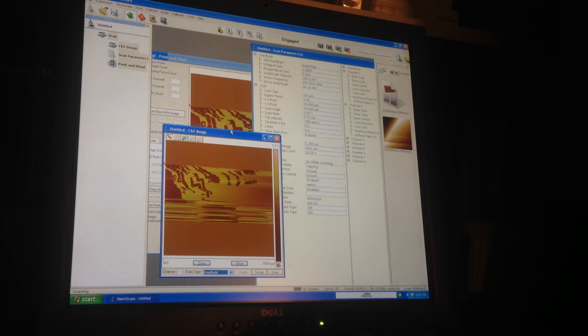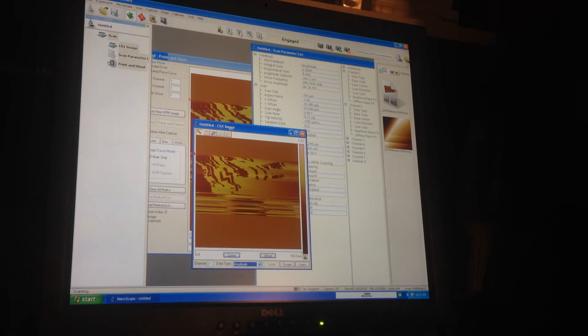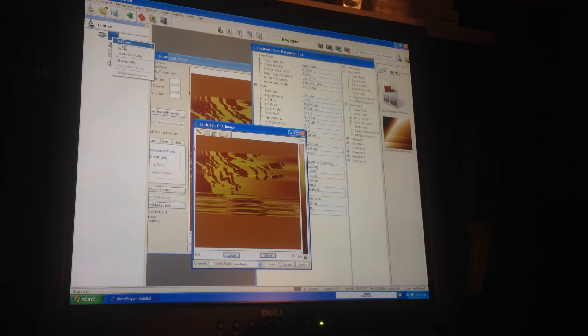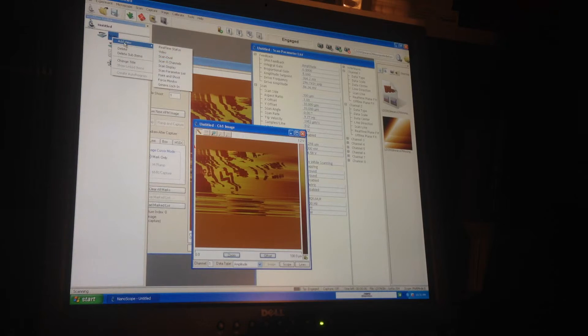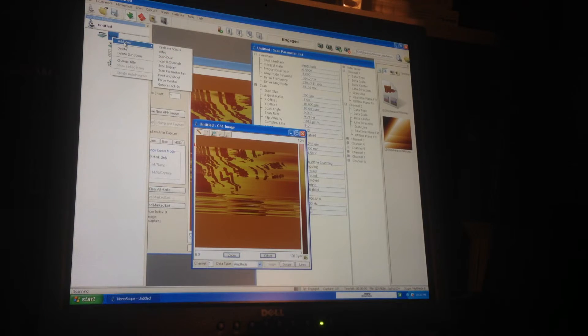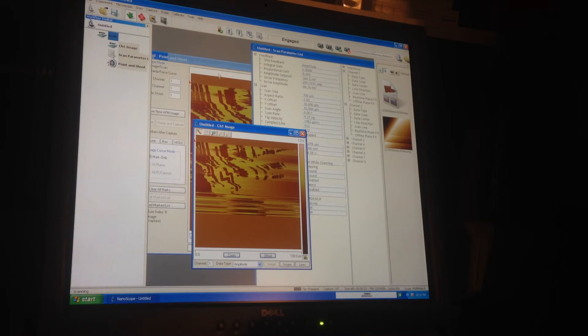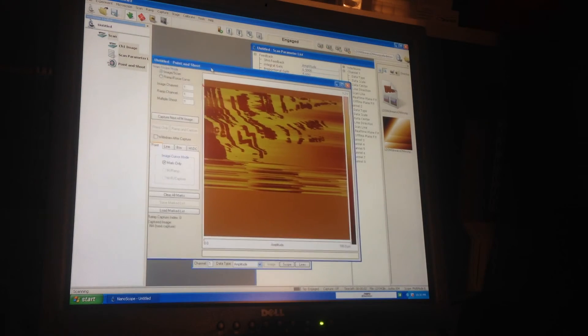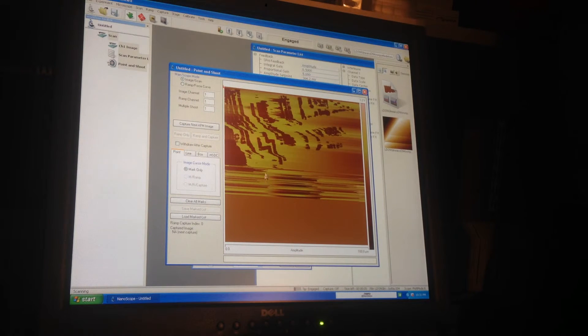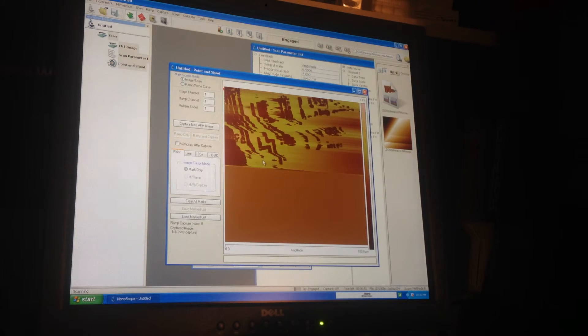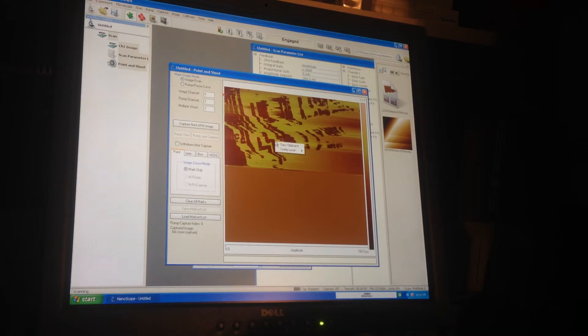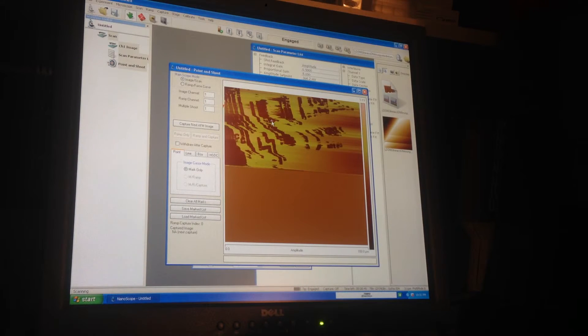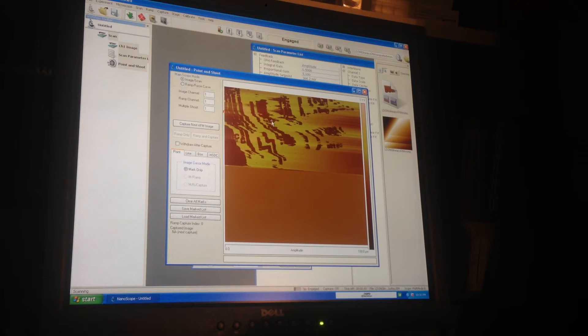This is the real-time scan display - what do they call it, real-time status - and this is point and shoot, which is for actually taking your final images. I generally just right-click and do copy to clipboard, that's what I've been doing so far and that seems to work fine.